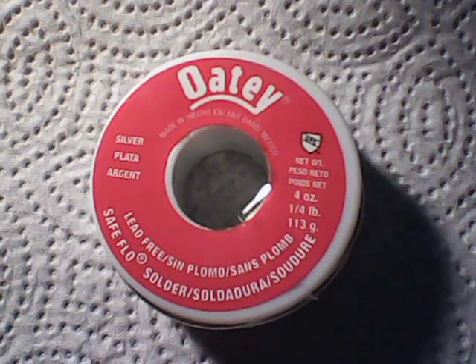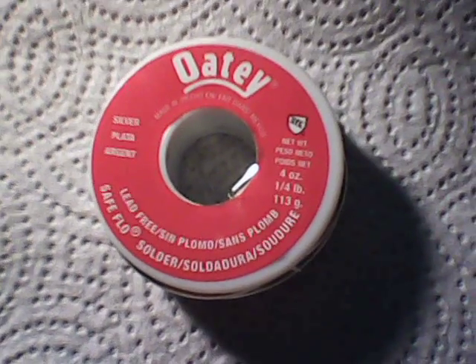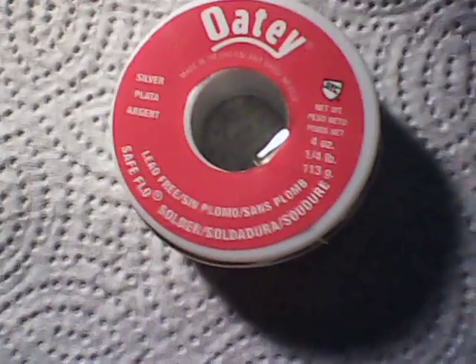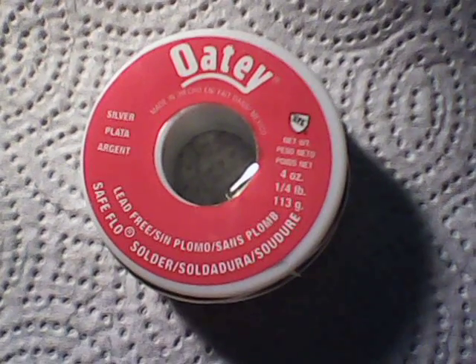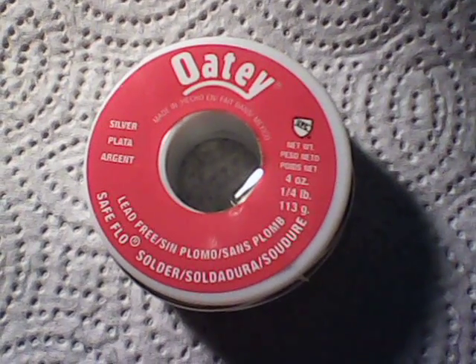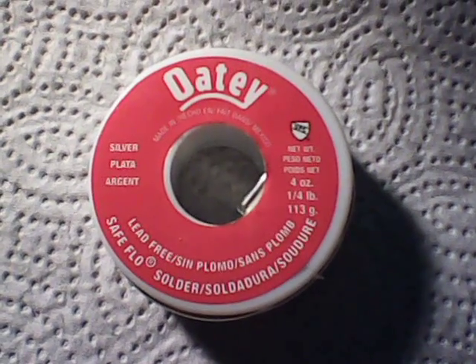We were discussing the fact that silver solder does contain silver — it's got a certain percentage of silver in it. He wanted to know if the silver could be reclaimed out of it. I'm sure that it can. He went out and purchased this roll just for me to check and see if I can reclaim the silver out of it, and how much can be reclaimed from this four ounce roll. It was bought specifically for the purpose of this experiment.